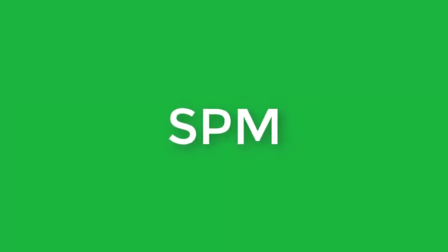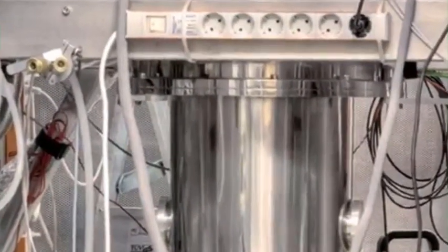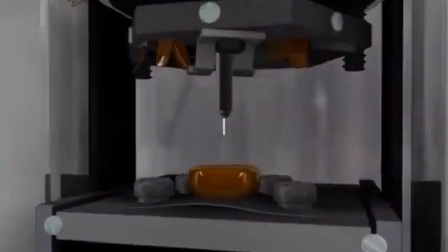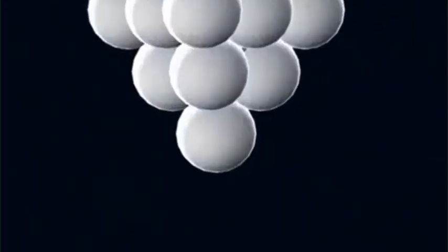Scanning probe microscopy. In the past decade and a half, the field of microscopy has experienced a revolution with the development of a new family of scanning probe microscopes. The scanning probe microscope, SPM, of which there are several varieties, differs from optical and electron microscopes in that neither light nor electrons are used to form an image. Rather, the microscope generates a topographical map on an atomic scale that is a representation of surface features and characteristics of the specimen being examined.